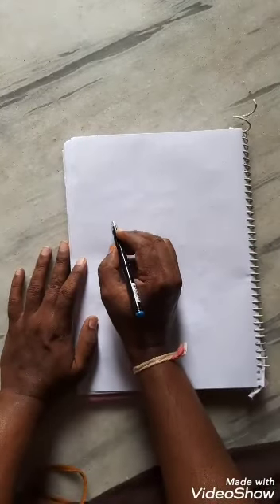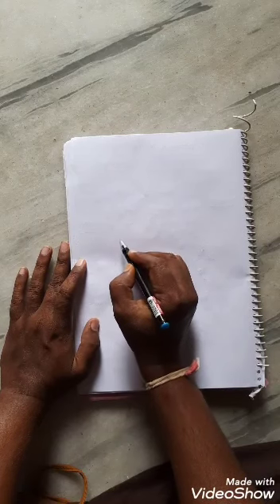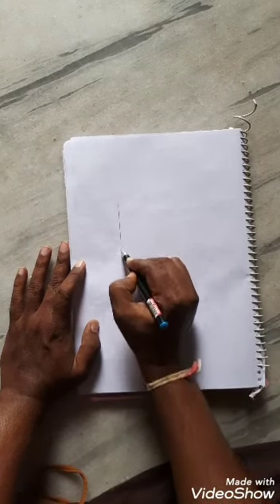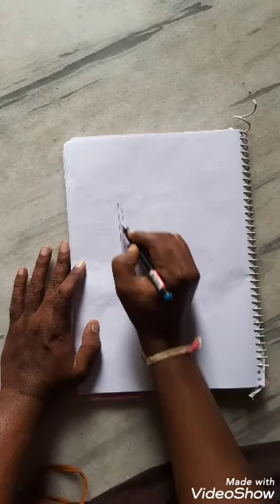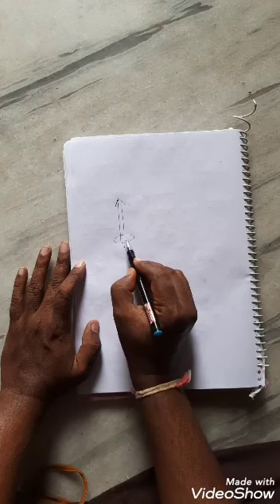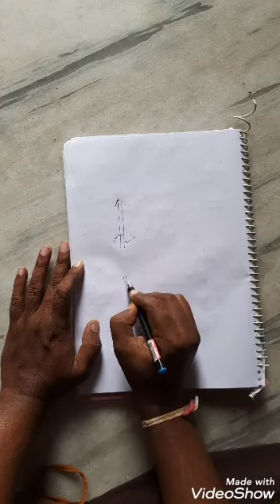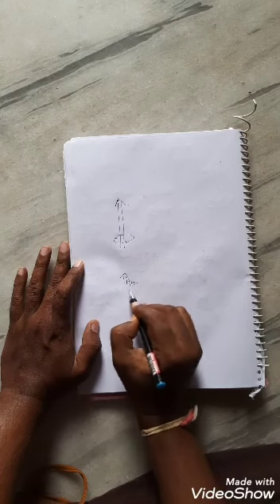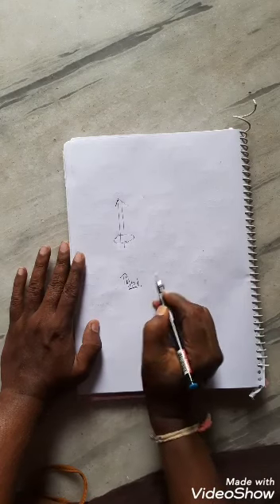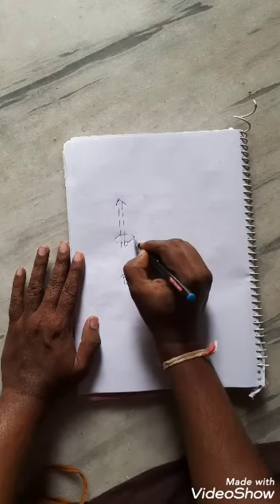So it is the precessing body under the influence of the external magnetic field, right?